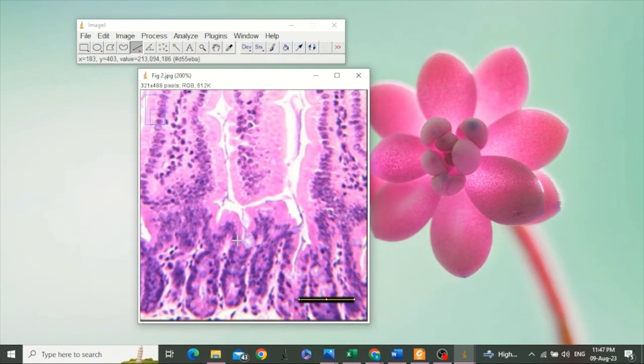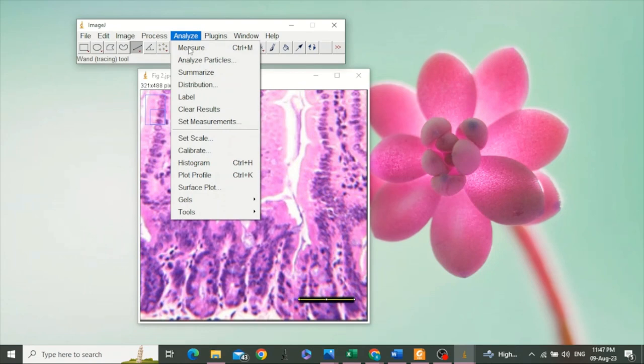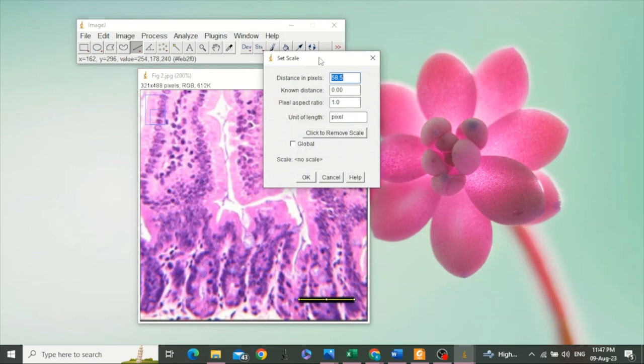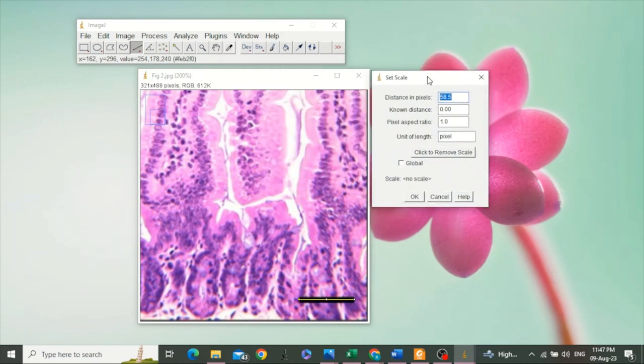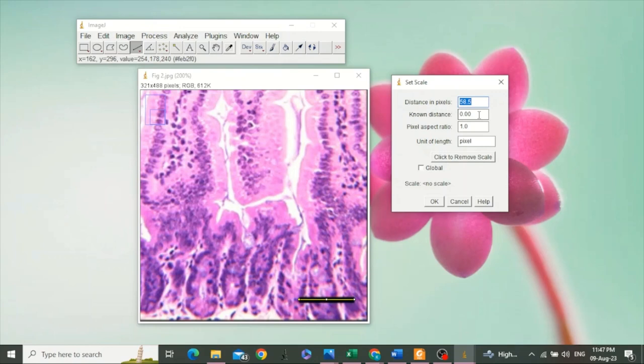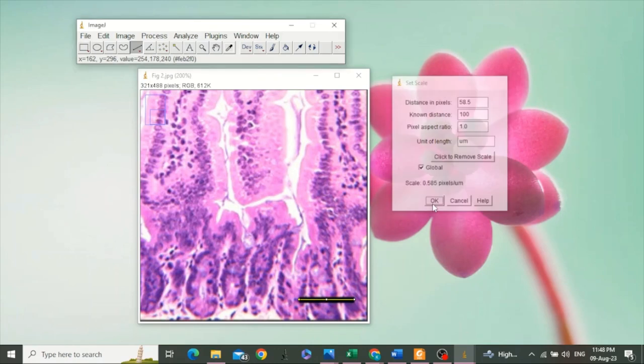After drawing the line, go to Analyze and click on Set Scale. Here a dialog box has appeared. It says the distance in pixels is 58.5; we are not going to change it. The known distance is 100 micrometers. Unit of length is micrometers, and we will check Global, and then click OK.